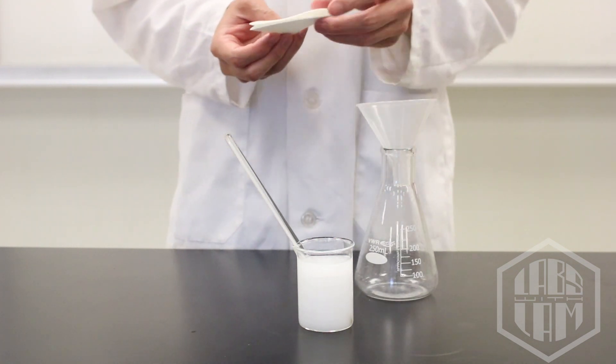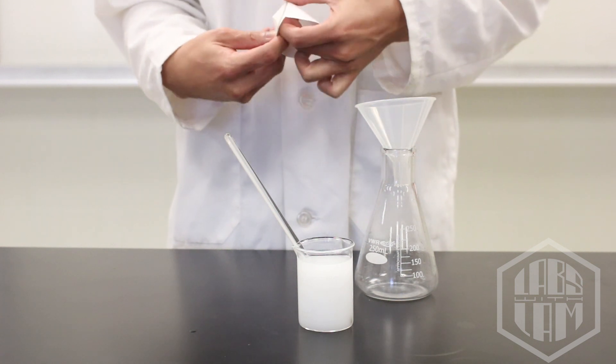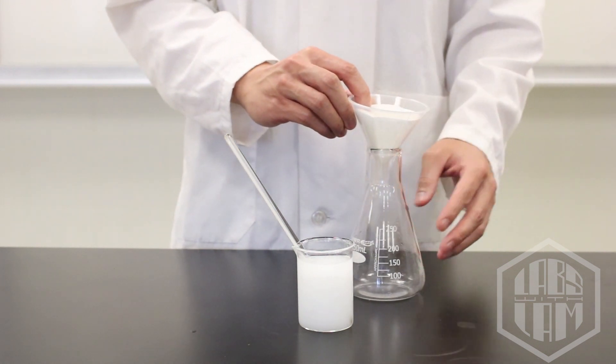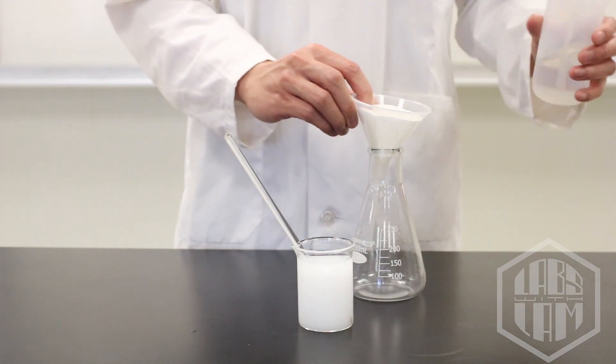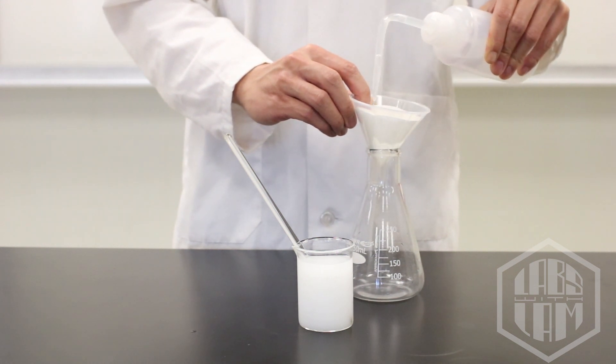Now to place it in the funnel, I'm going to find this little pocket, open it up, and I'm going to hold it down in the funnel. Now I'm going to use the wash bottle to wet the filter paper just a little bit, which will cause it to adhere to the funnel and stay where it is.